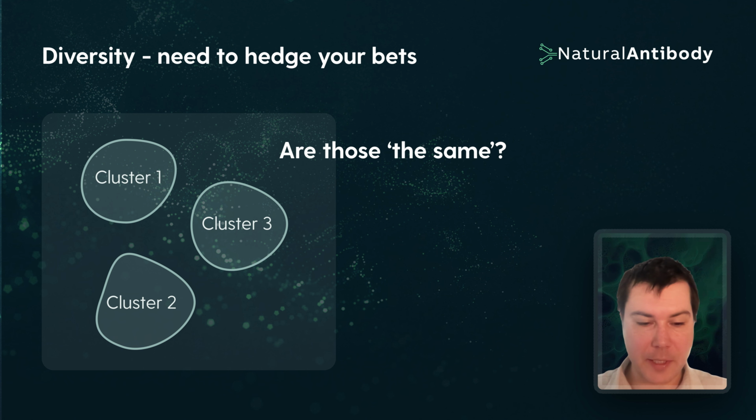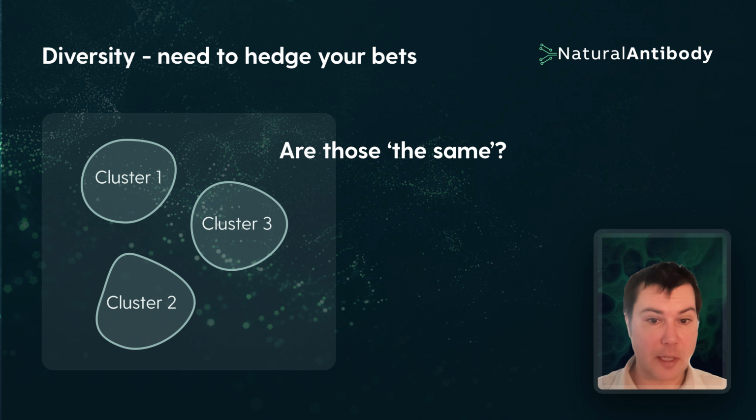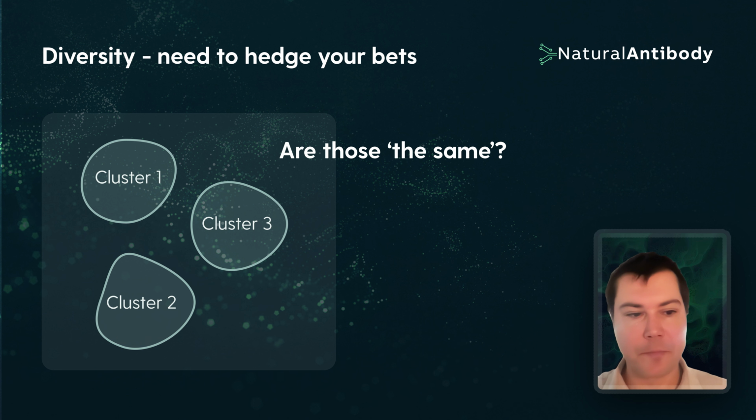This is a very ambiguous term, because if I say that those sequences are diverse in terms of sequence, if they have only one amino acid difference, then yes, they are diverse, but it is quite likely that they actually have very similar properties to one another. I would actually need to cover different bases to increase my chances that the sequence actually has a good amount of properties. Otherwise, I'm checking pretty much the same thing.